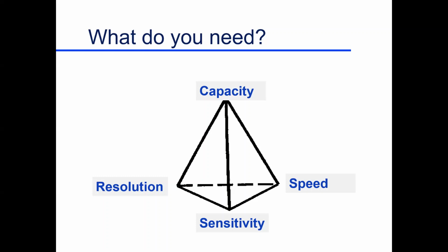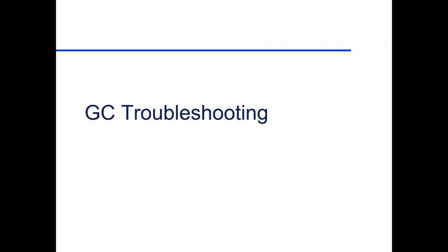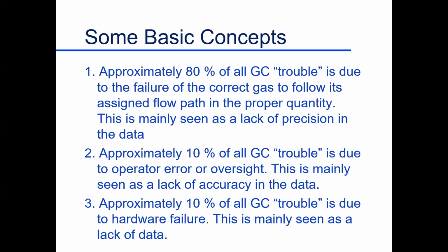The speed is important to us, so separation is easy. We have a different set of parameters. We're looking for trace amounts. So we adjust all those parameters, like the column diameter, column coating, and so on, based on what we need. If we don't need separation, now we get away from that. We go over to this side of parameters and go for speed. So it's rather interesting. In most cases, we don't necessarily know what we're doing. Maybe I should complete that a little better.